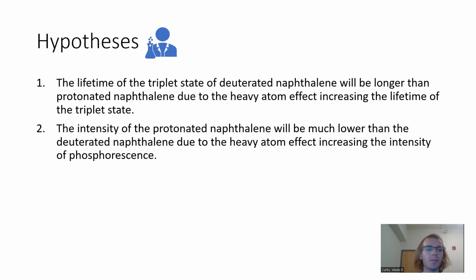For this experiment, we had two hypotheses. First, the lifetime of the triplet state of the deuterated naphthalene would be longer than the protonated naphthalene due to the heavy atom effect increasing the lifetime of the triplet state. And second, the intensity of the protonated naphthalene will be much lower than the deuterated naphthalene due to the heavy atom effect increasing intensity of phosphorescence.